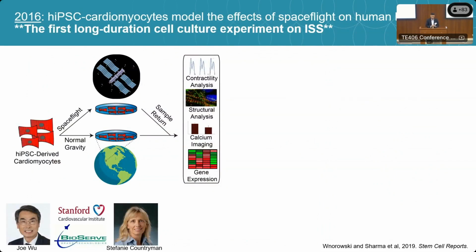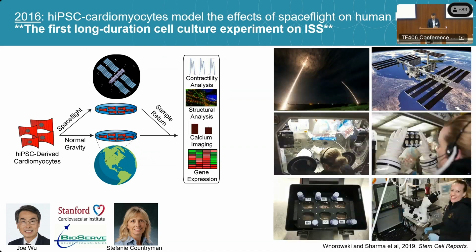About 10 years ago, when I was a grad student in Joe's lab, I had the opportunity to conduct this project, which is the first long-duration cell culture experiment conducted on the International Space Station, and this was in partnership with Bioserve, and Stephanie representing Bioserve in the back. This is a relatively straightforward project where we're growing two-dimensional adherent cardiomyocytes for a period of 30 days aboard the International Space Station, and then characterizing them using contractility analysis, structural analysis, and genetic analysis as well.